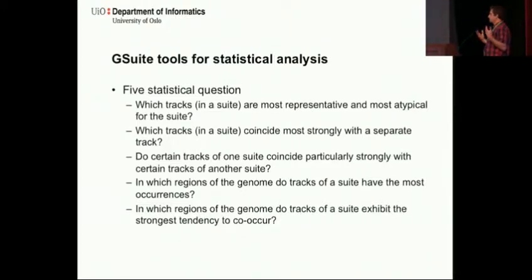Creating a heat map as an output. A useful biological example would be to assess the enrichments of somatic variants of different cancer types in heterochromatin datasets for different cell types.